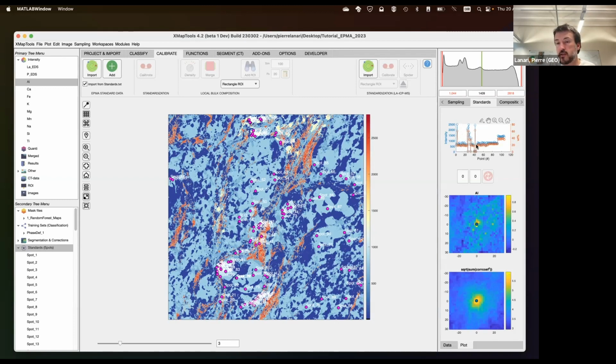The two profiles should be quite parallel if the location of the spot analysis is quite good. And this is exactly what this allows you to check. And indeed, what the program is doing here, it's calculating the correlation between the intensity and the weight % data. So it's calculating the correlation between those two curves. And this is the result that is plotted on this map.